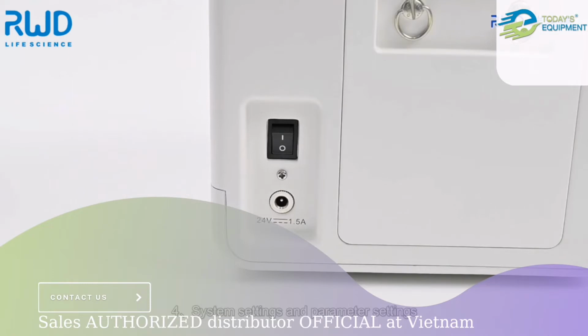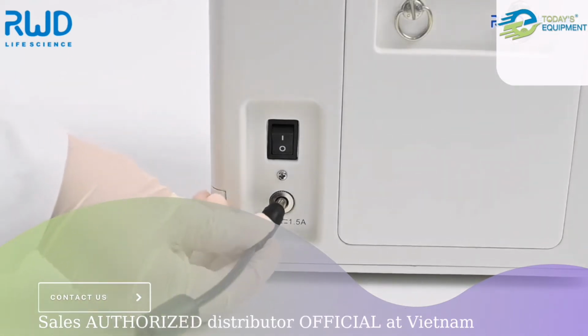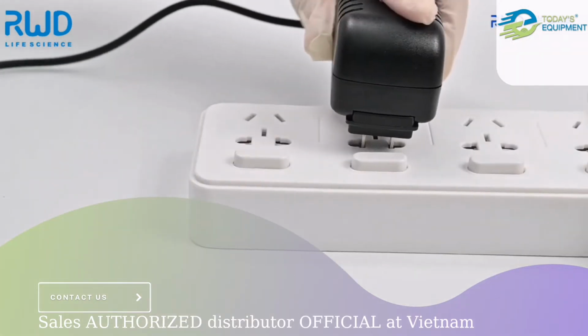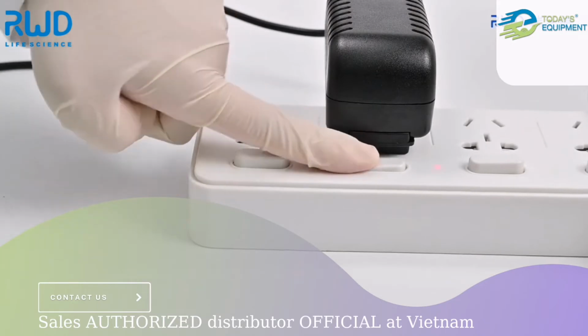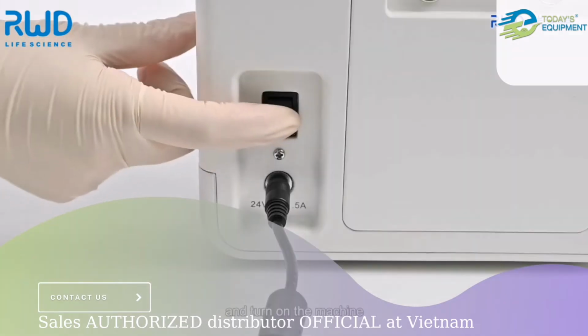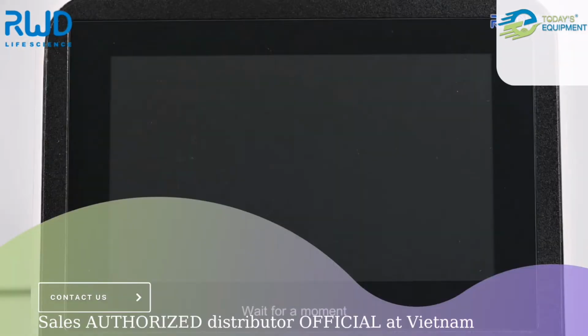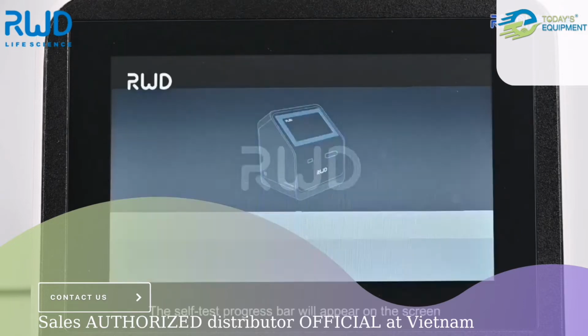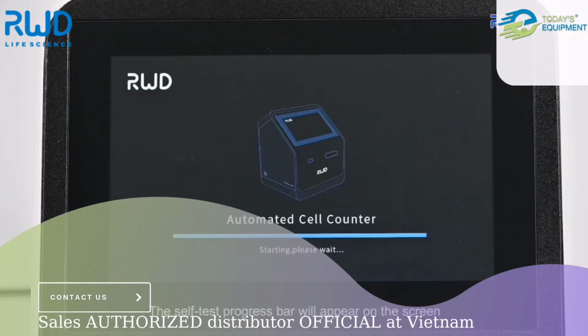4. System settings and parameter settings. Connect the power cord. Switch on the power and turn on the machine. Wait for a moment. The self-test progress bar will appear on the screen. Wait for the power-on self-test.